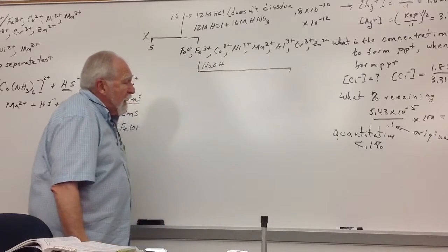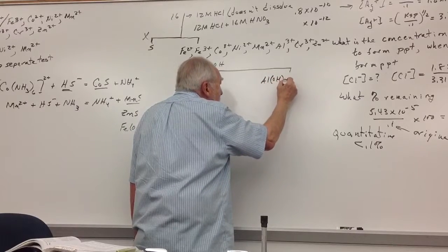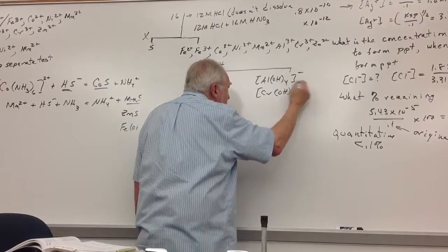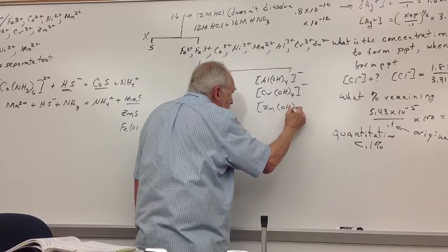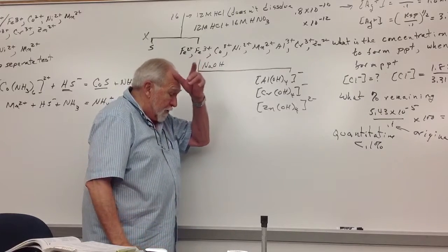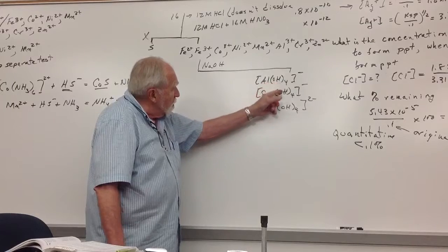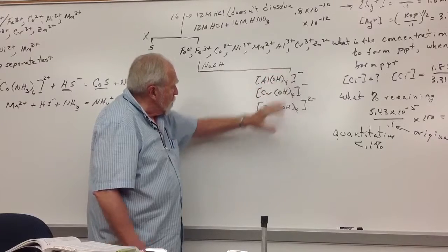The decantate contains, in other words, way back in procedure 6, when you separated the A and B groups, you had different proportions of the sulfide ion, trithio, tetrathio, etc. Here they're all going to be tetrahydroxos. Okay? So this is what's in the solution phase.